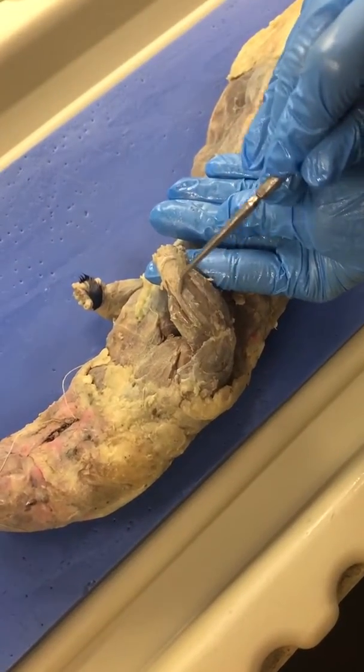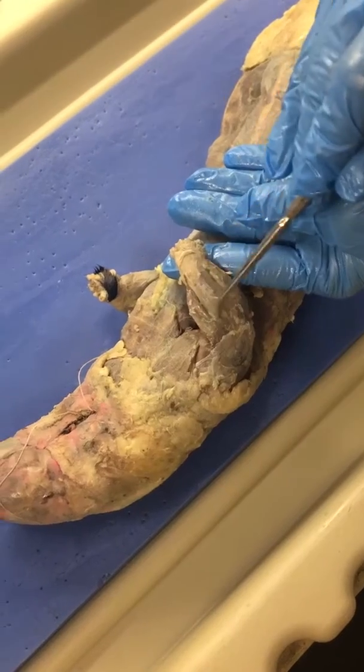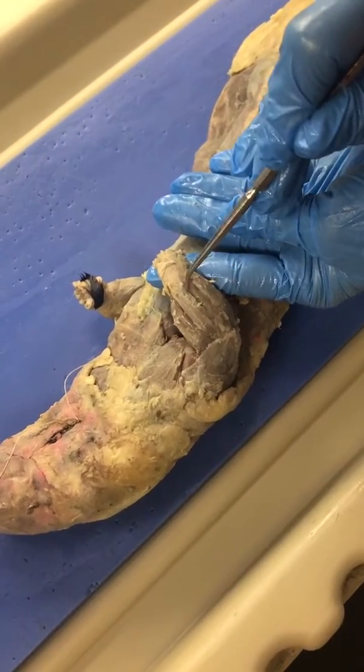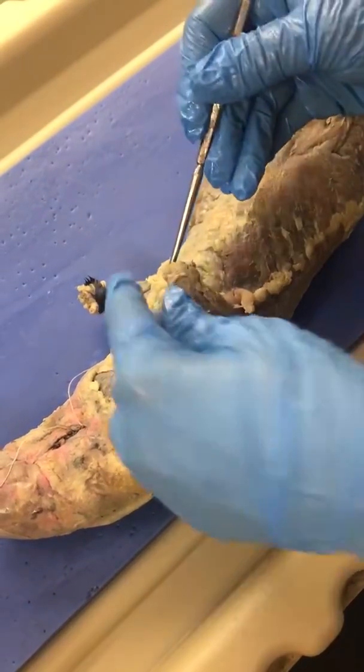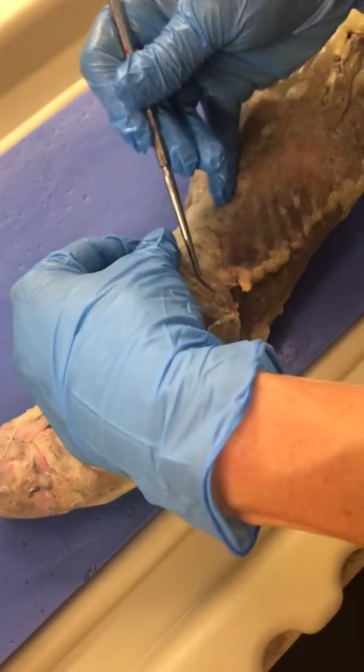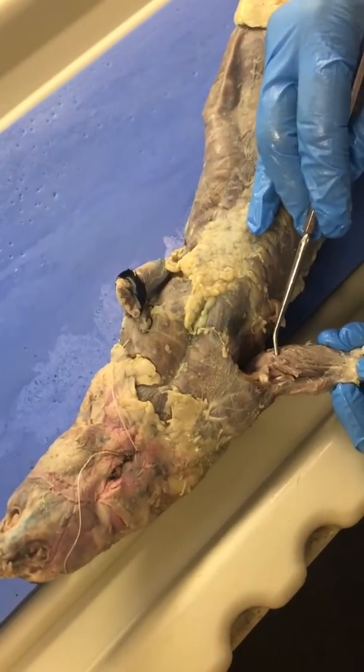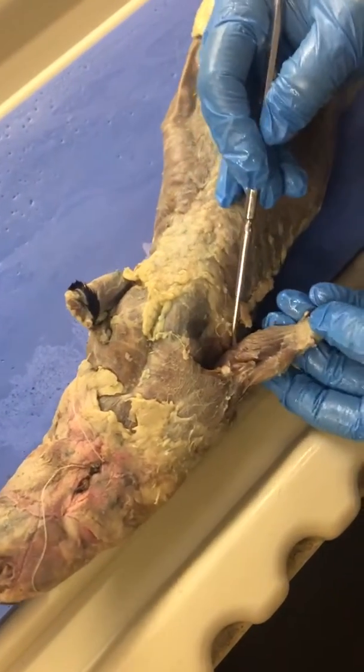This one right here is the extensor digitorum, and then this one right here is the extensor carpi ulnaris. This one is a flexor because you can see that it attaches onto the inside of the elbow on the anterior surface.